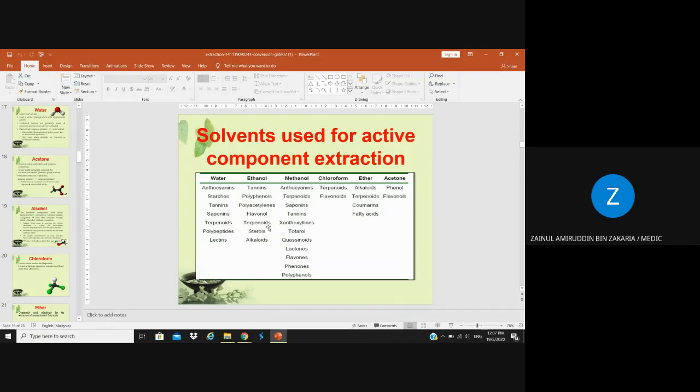When you use methanol or ethanol, you need to first isolate the compounds into polar, non-polar, and intermediate. So when you have a crude methanol or ethanol extract, you dry it, you have a sticky paste of crude extract, you put water inside it, you shake it until everything dissolves. You will have some part that is not dissolved. That is the lipid-based part. So don't worry.